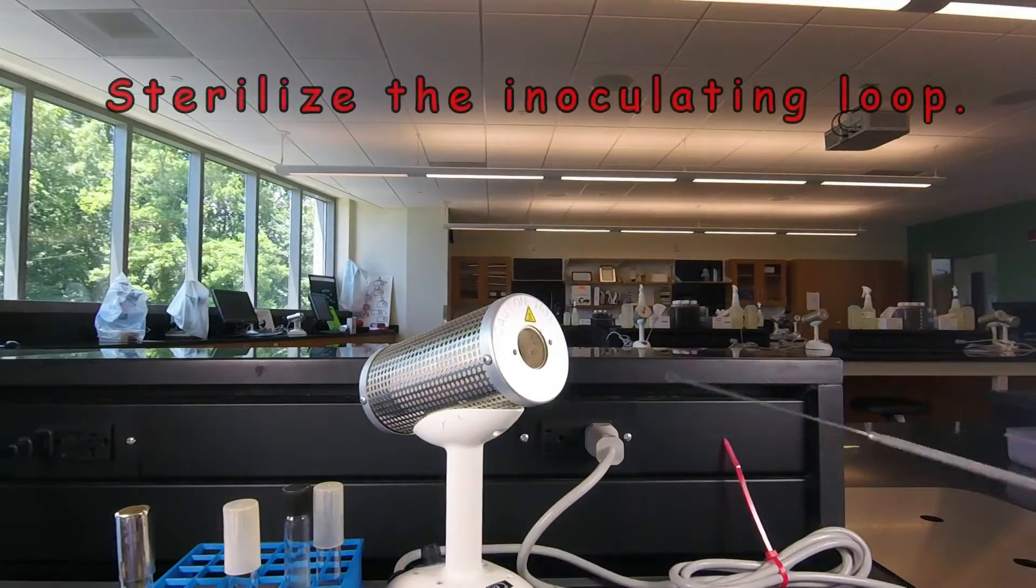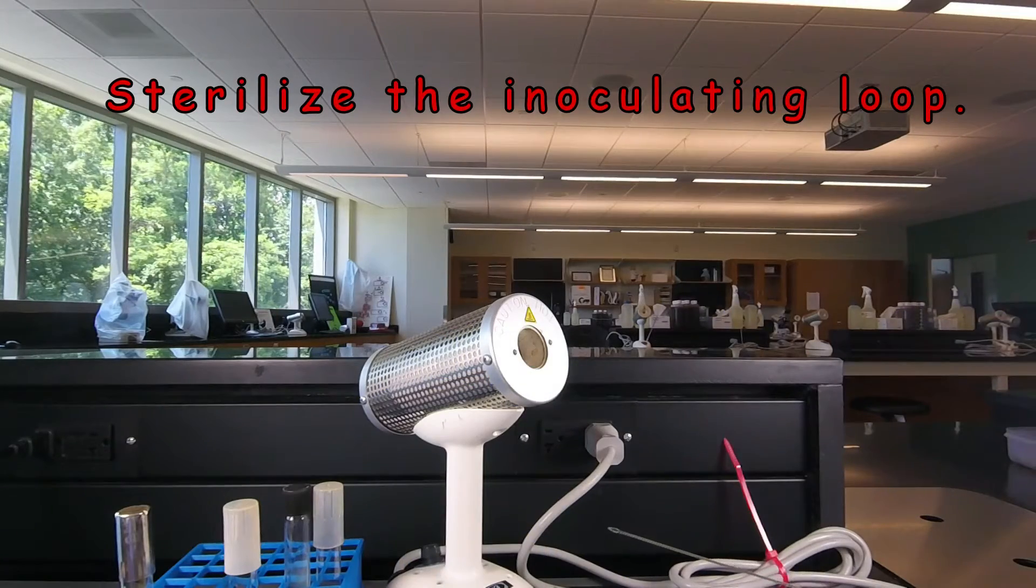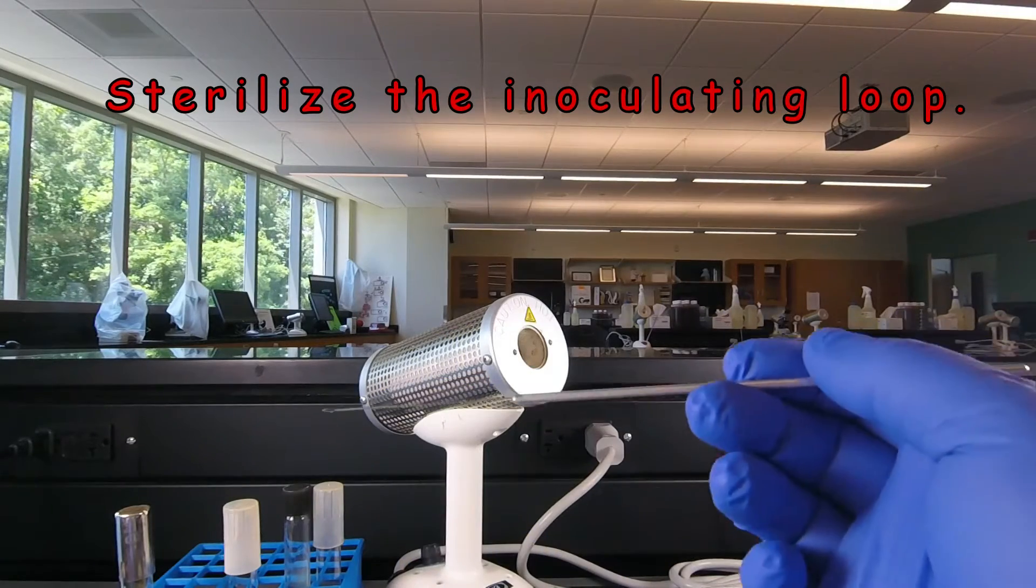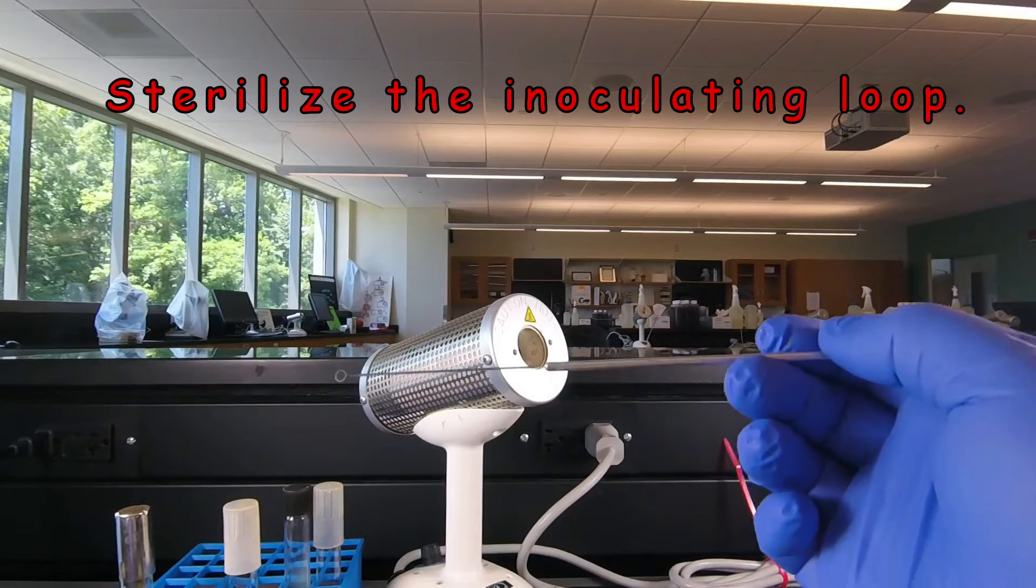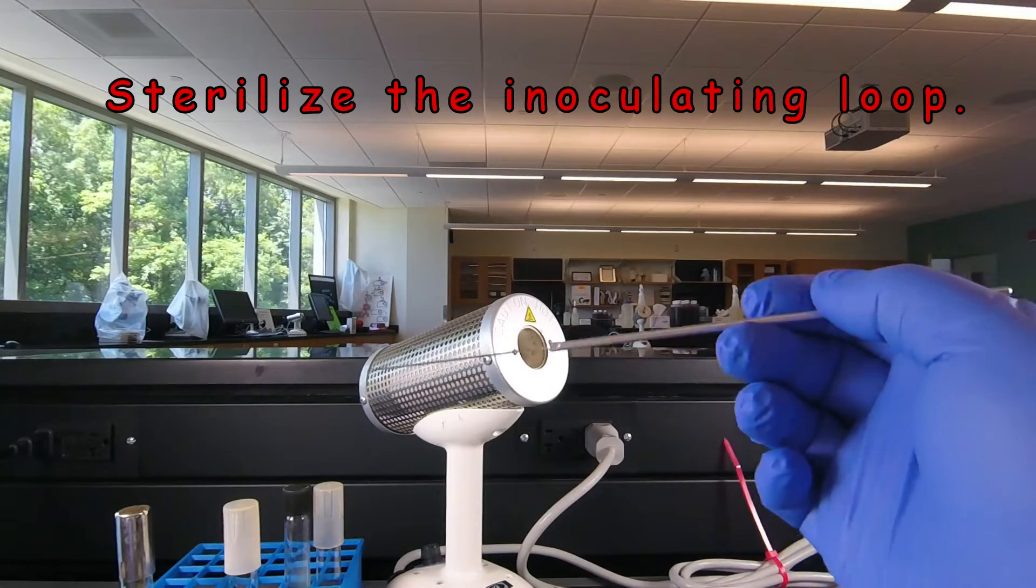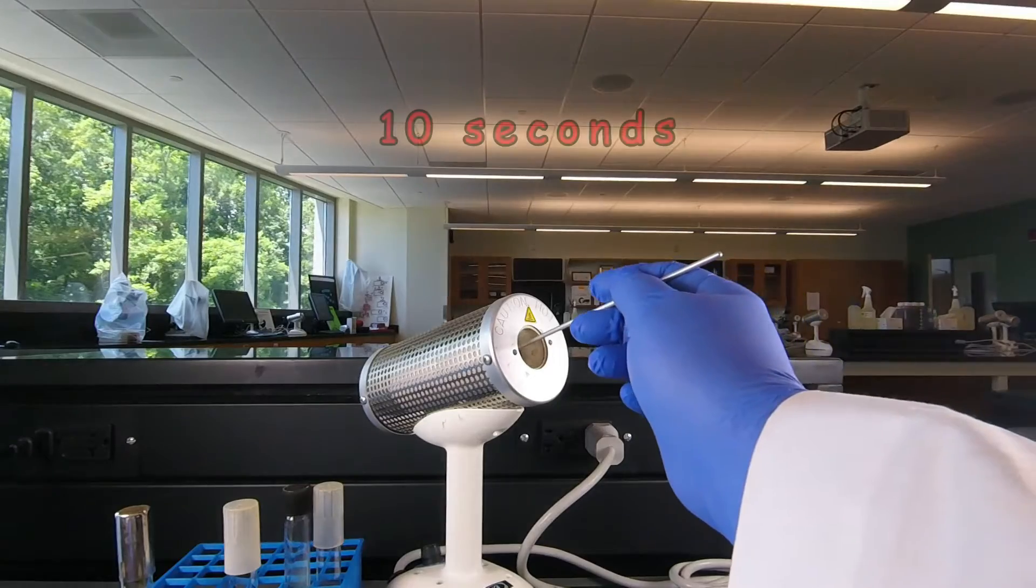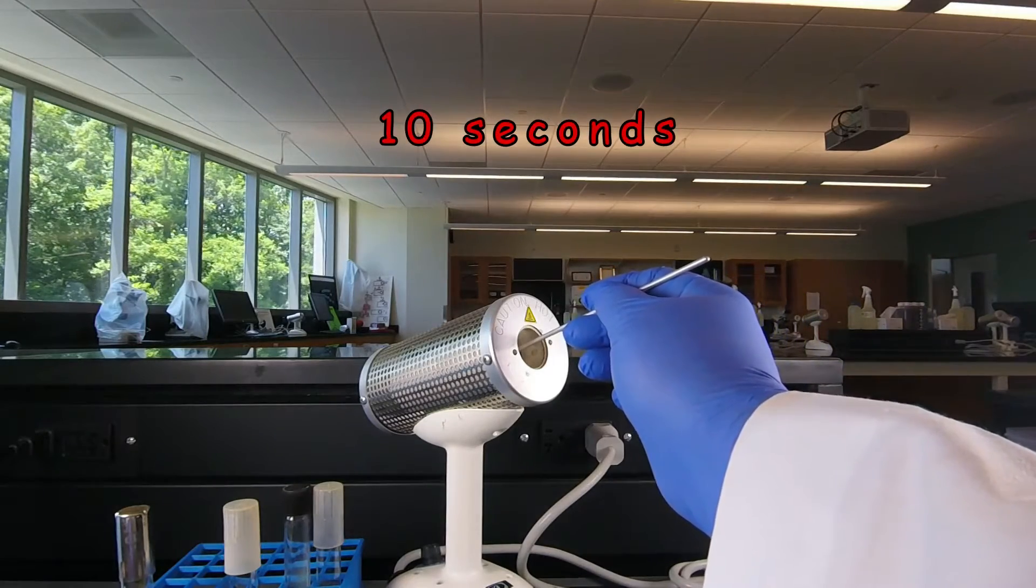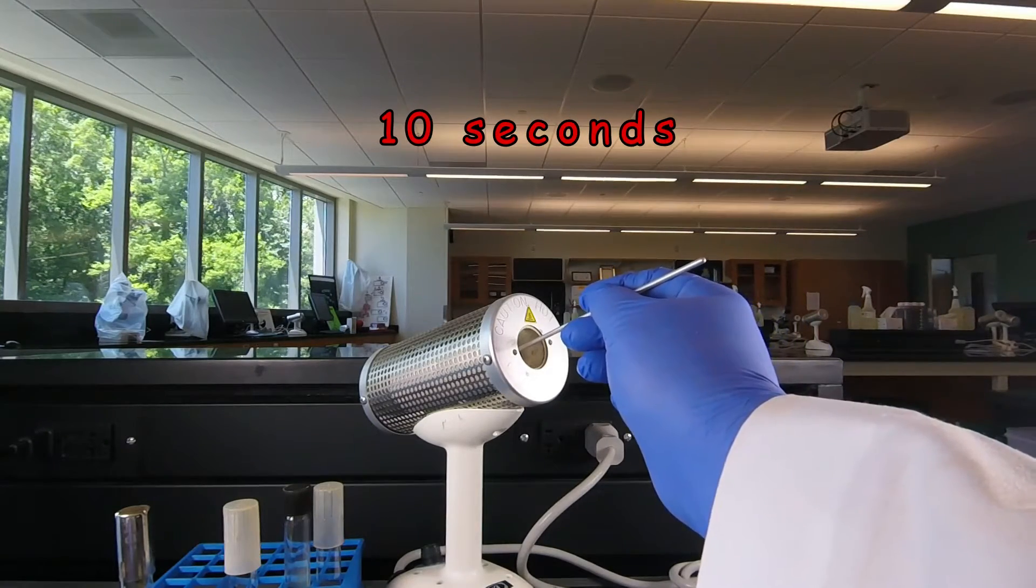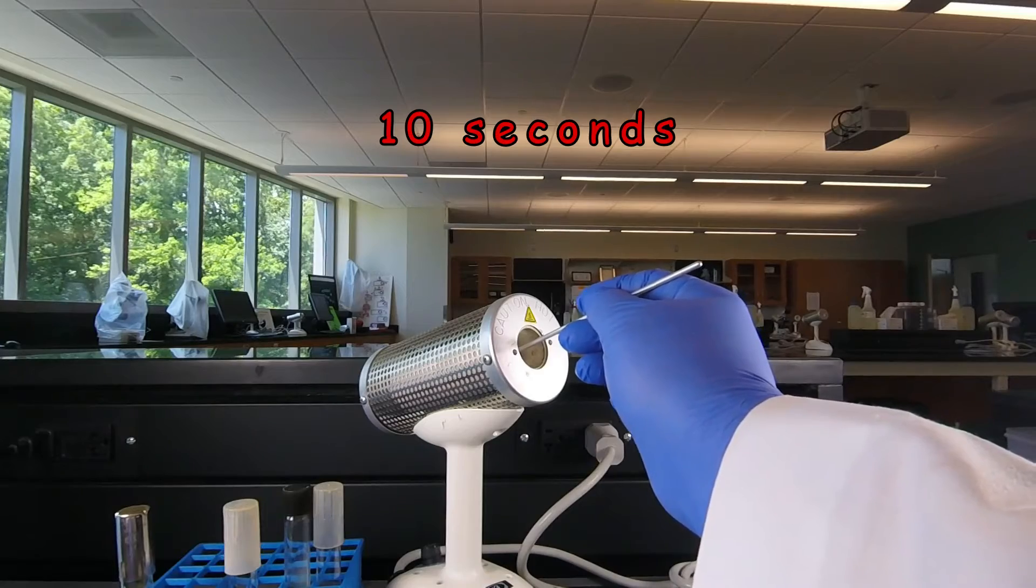We start of course by sterilizing our inoculating loop. So again we hold the inoculating loop in our hand, kind of like we would a pencil. We stick it in the Bactone cinerator, hold it in for a full 10 seconds. You want the whole wire and the beginning part of the handle in the Bactone cinerator.